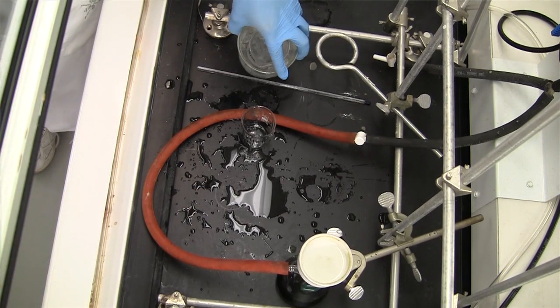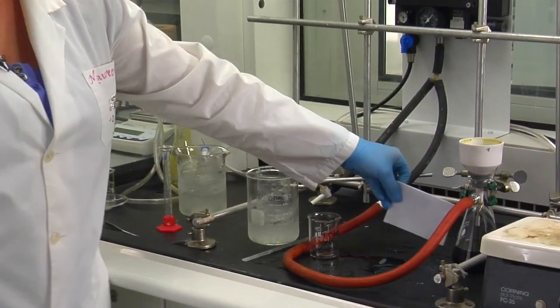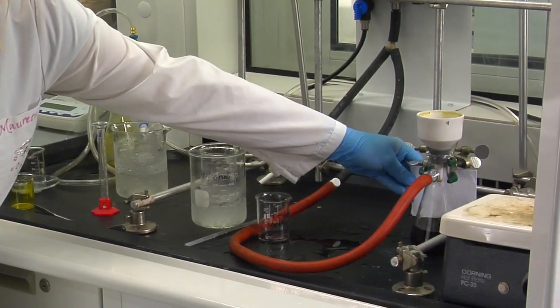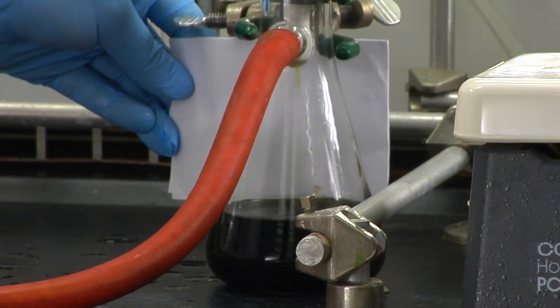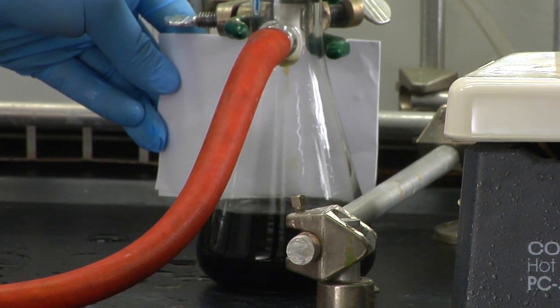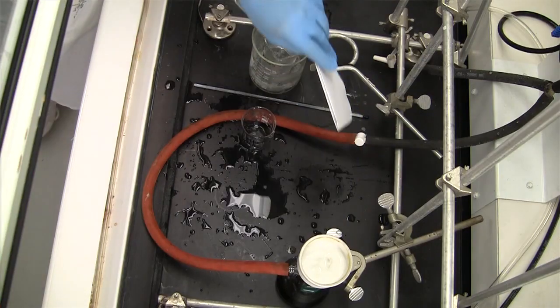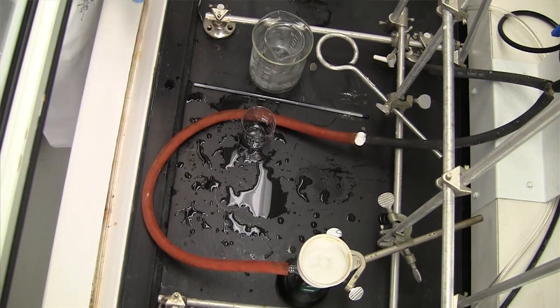You can check this by grabbing a white piece of paper and putting it behind your filter unit to see the color of the solution coming through. Right now it's still green, so we're going to need to wash with some more methanol.